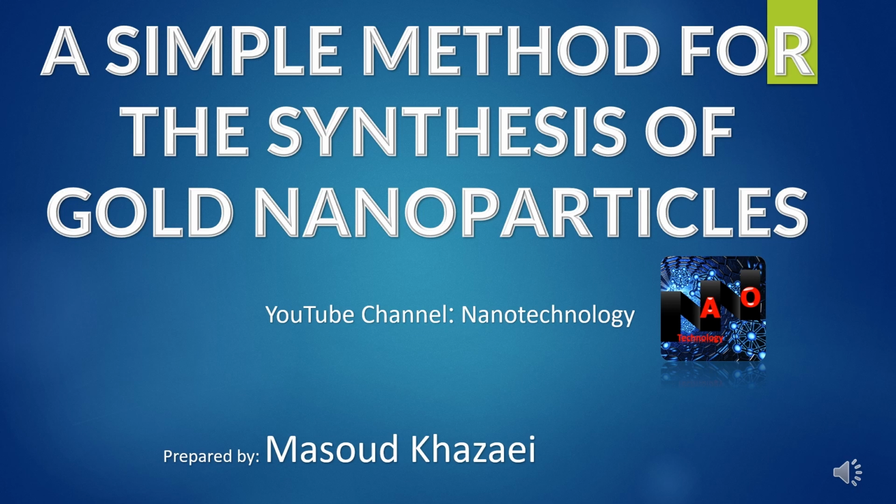Welcome to Nanotechnology, exploring the world of infinitely small. Today's highlight is a simple method for the synthesizing of gold nanoparticles.